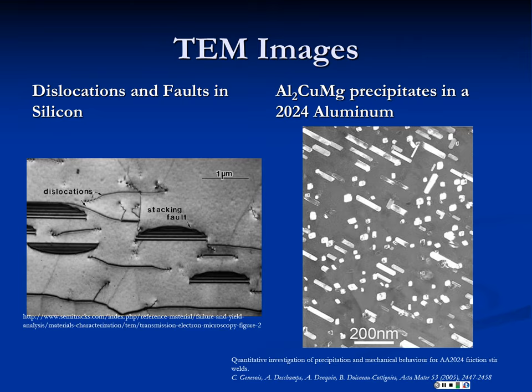Unfortunately, you can only see things in section. And so this didn't really get nanotechnology launched because you couldn't look at surfaces. And as we've already discussed with defects and particles and energies of surfaces, surfaces are where the action is. So the key revolution for nanotechnology has been the ability to look at things on surfaces at the nanoscale, not in section, because we've been doing that for quite a long time. All right, and that completes this section, and next class we will begin discussion of diffusion.